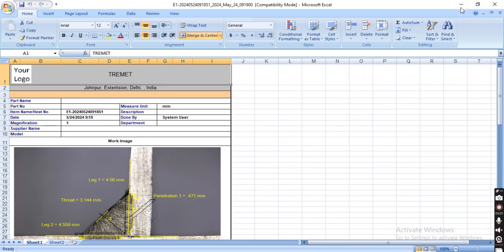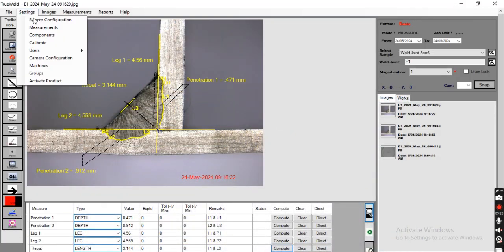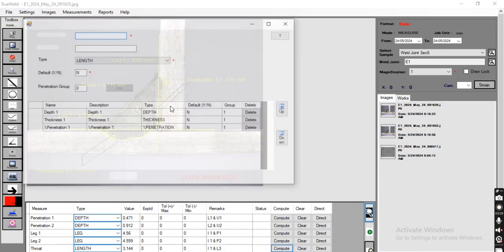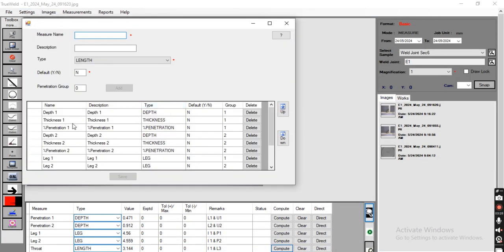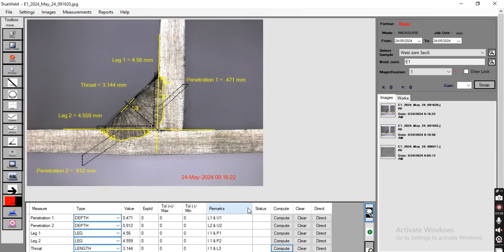Users can also add more parameters as per requirement from here, like depth 1, thickness 1, penetration 1. If any more parameters are required to measure, they can add those names here and also save the file as per their requirement. This is our weld penetration software and this is the measurement of the component which you sent to us. If you have any further queries, you can call us. Thank you.